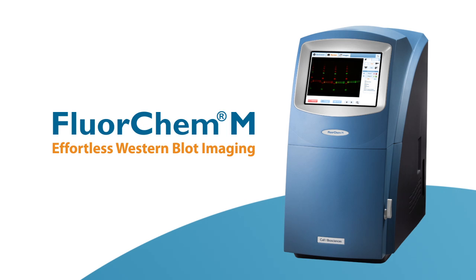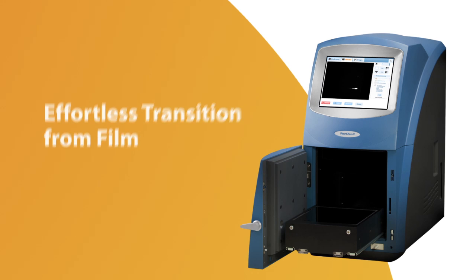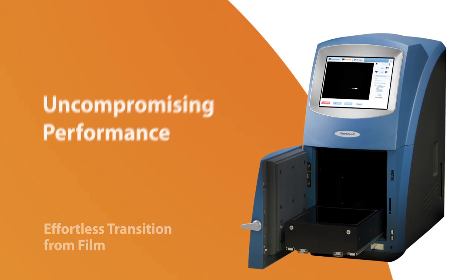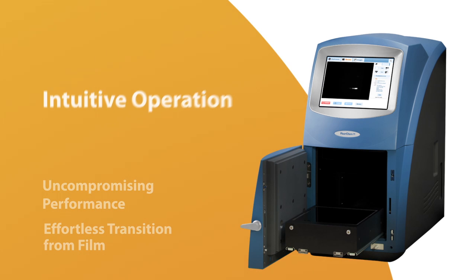Introducing the FluorChem M from Cell Biosciences, setting a new standard for effortless multiplex Western blot and gel imaging. With the FluorChem M system, transitioning your Westerns and users has never been easier. FluorChem M's intuitive workflow, touchscreen control, and fully automated optics take the complication out of imaging.